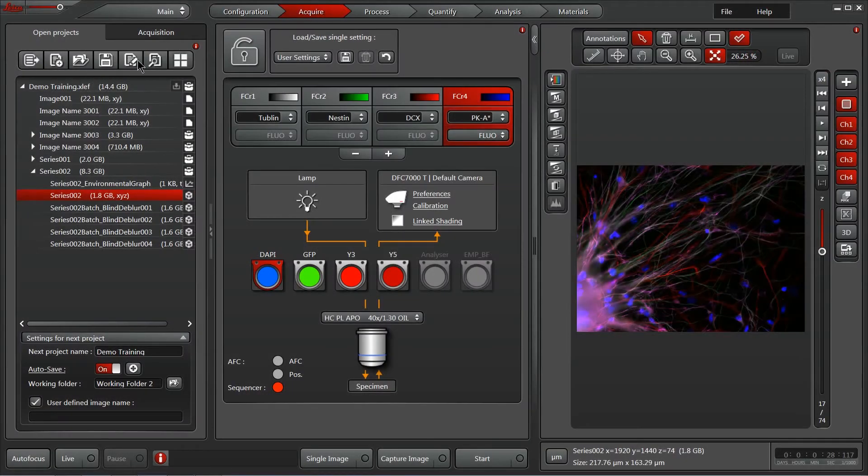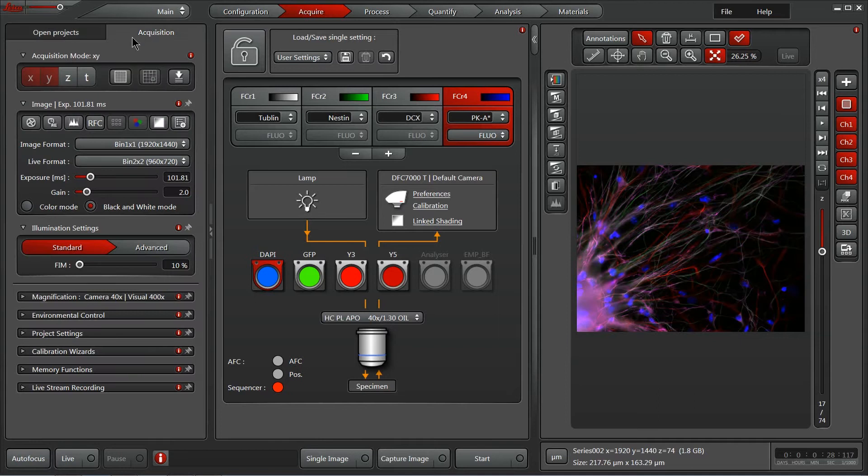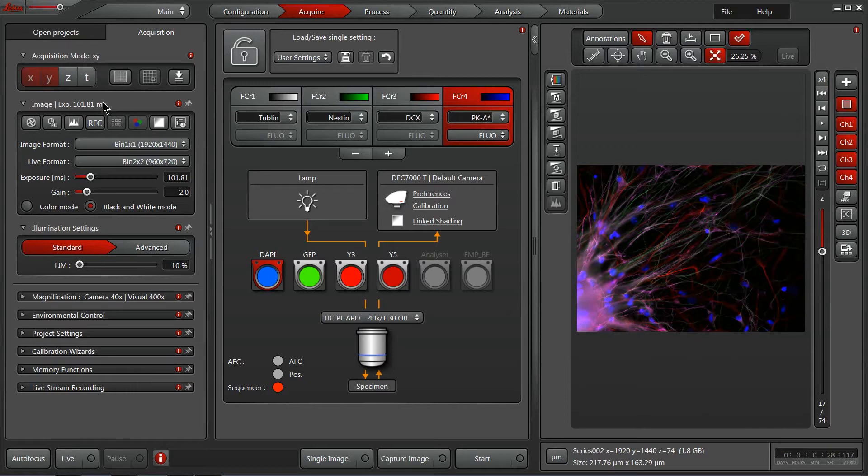Now let's continue into our acquisition tab. The first thing we'll see is the acquisition mode where we control which dimensions will be included in our experiment. Here, all the ones that are selected will be highlighted in red.